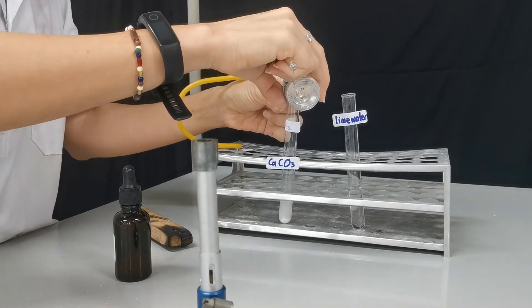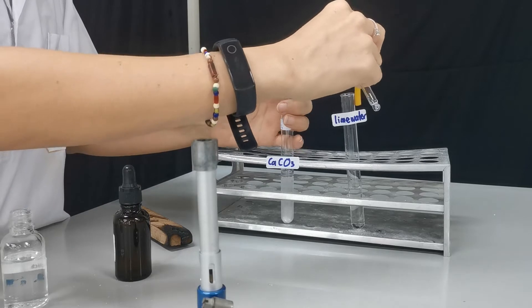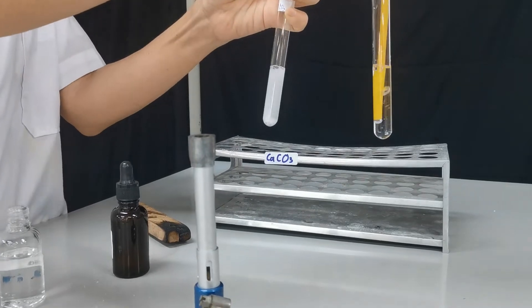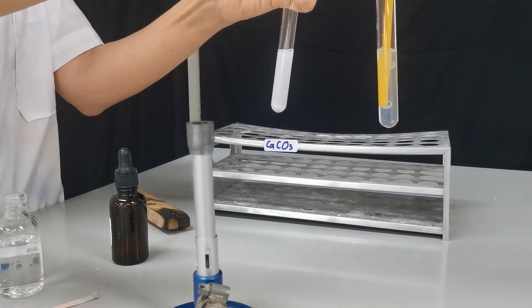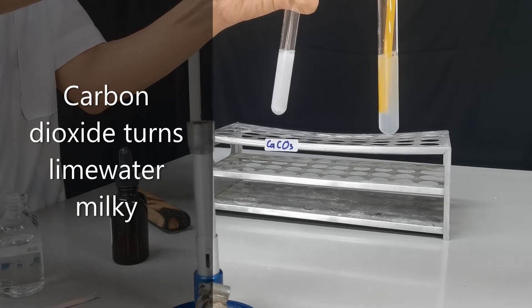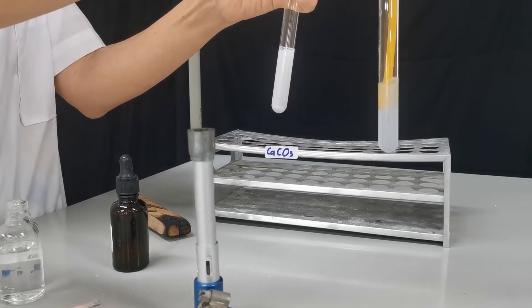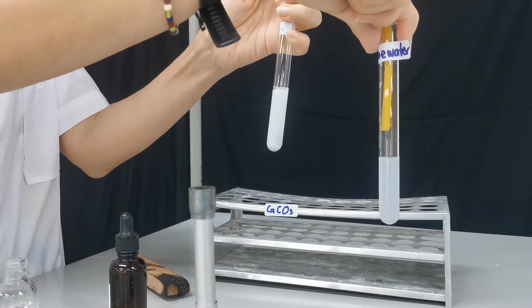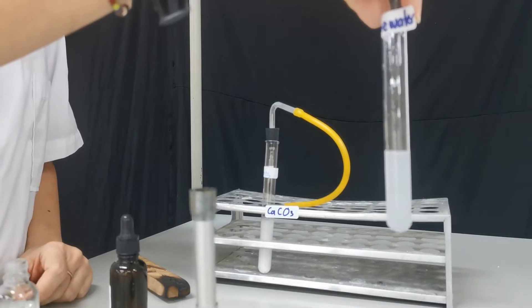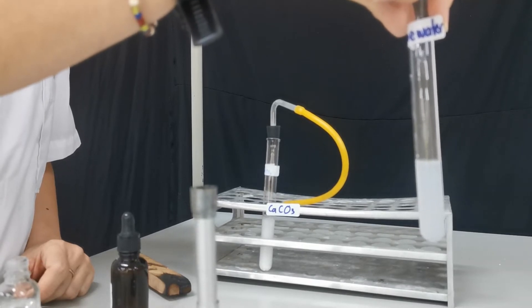We're going to deliver this gas into lime water using a delivery tube. You can see how the lime water now turns cloudy — it started with a clear solution and now the lime water turns cloudy. That's because carbon dioxide reacts with calcium hydroxide solution, which is a colorless solution, to produce calcium carbonate, which is a white solid.